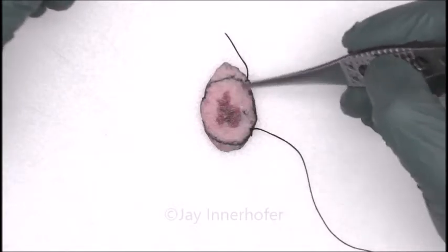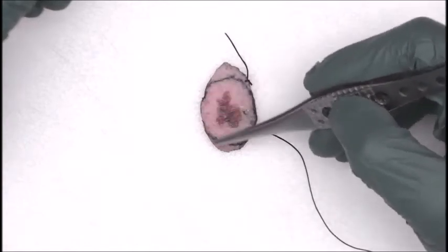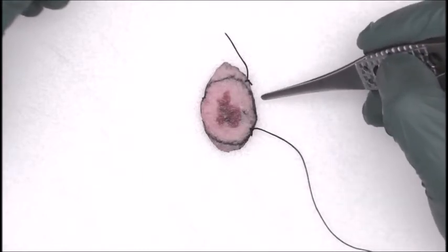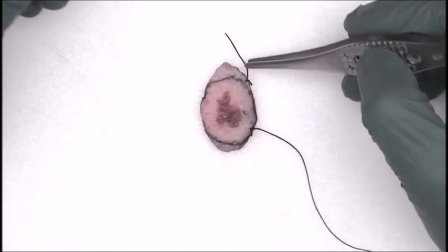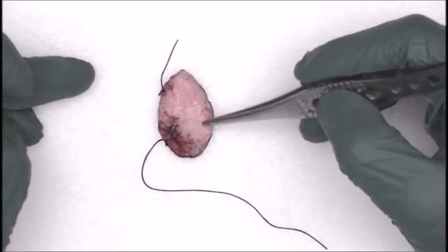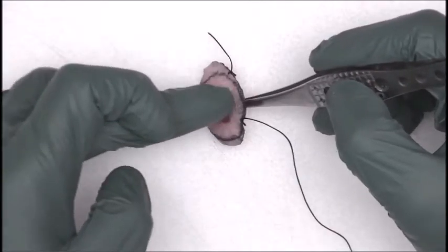We've got some previous ink or dye on the skin surface. This is where the surgeon has written on the patient prior to performing the excision. So, once again, tip, tip. We've got a suture here, lesion here. Let's flip it over and look at the deep aspect. There's a lot of fat here. We've got some cautery artifact here. Let's go back to the superficial side.